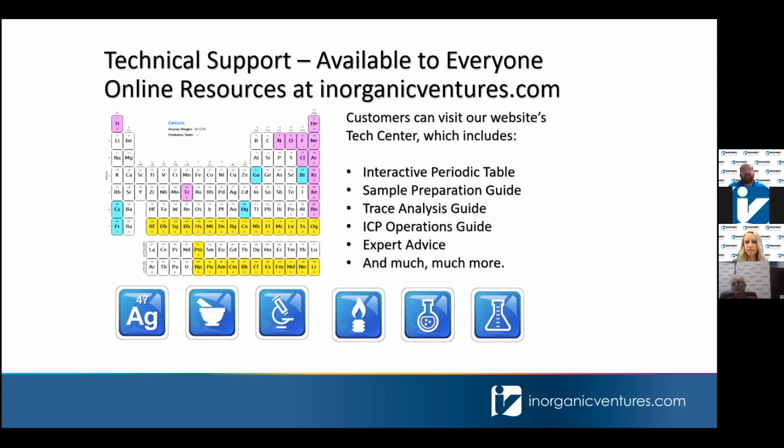Metallic wise, what is the triethanolamine packaged in? So I would say worry less about the brand that you get and maybe more of how it is shipped to you. Is it stored in glass or is it stored in plastic? You'll find that the trace metallic impurity profile is going to be a little bit different.